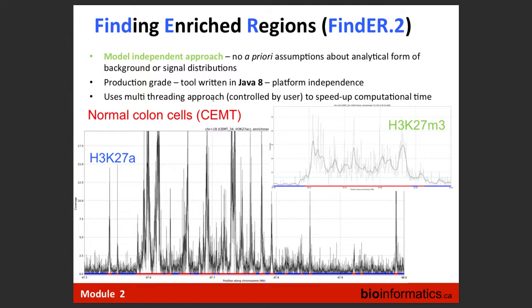Now, also comparing to MACS, we treat every mark the same. There is no such thing as punctated or extended. It's just one approach, coming from the idea or conjecture that the biological process behind histone modification setting is similar. So the writing of histone modification is similar for different parts, just recruitment to different locations happens differently. So this is like an extended region.